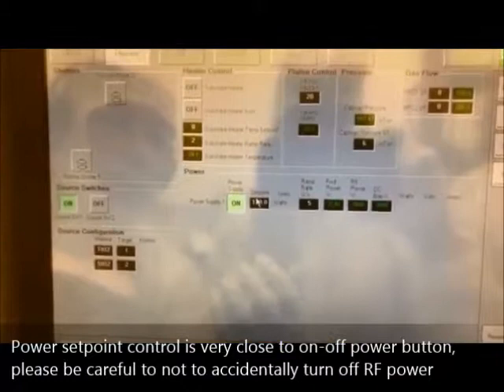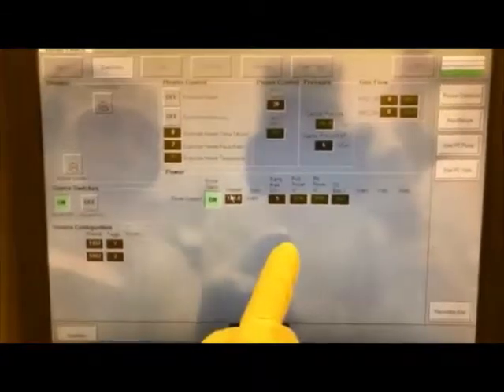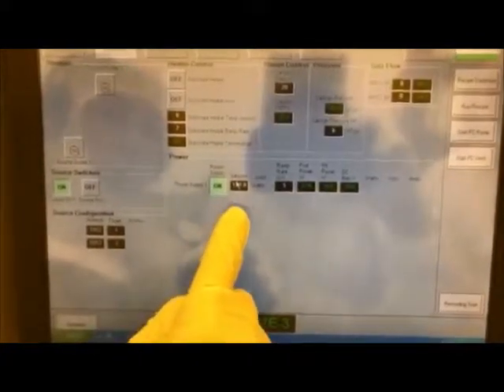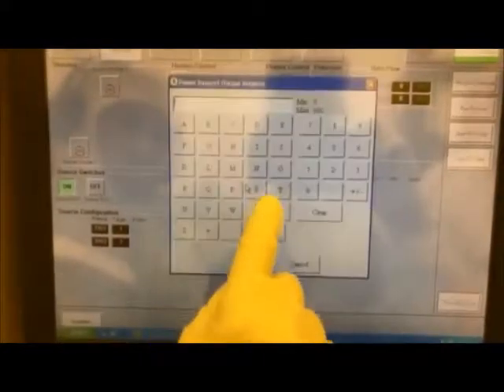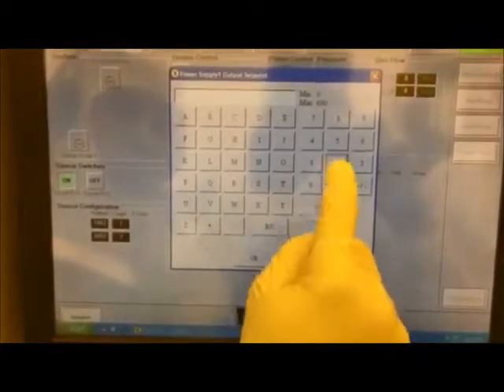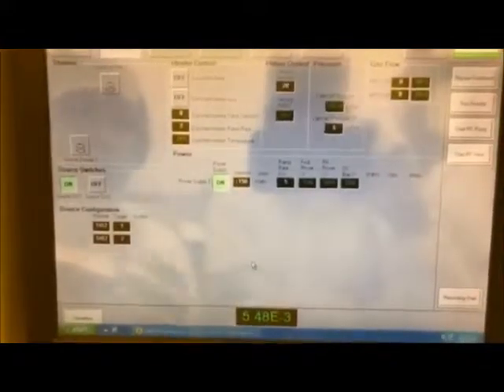We don't want to ramp down the RF power from 150 to 0 right away. If we ramp down, we'll ramp down at 10 watts per second. So be careful, don't accidentally shut off the RF power. Make sure you click correctly. So we'll change from 150 to 200. Again, after you ramp up the power, you check the plasma. The plasma stays on, which is good.